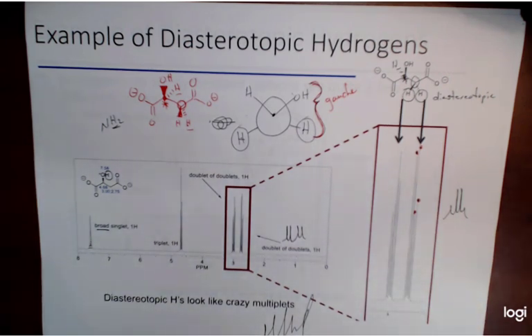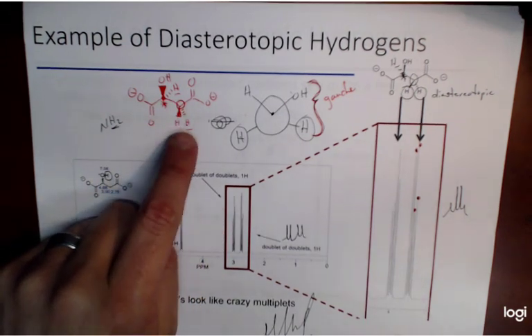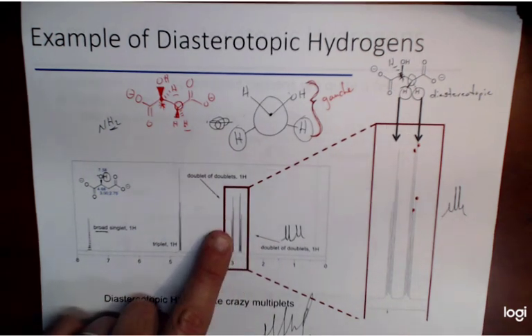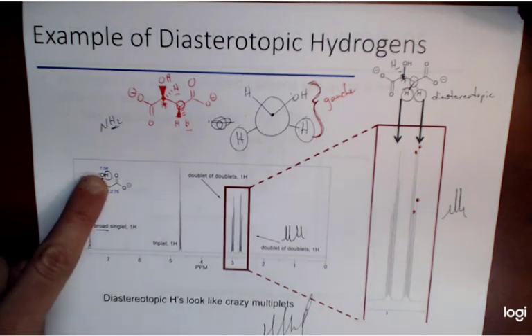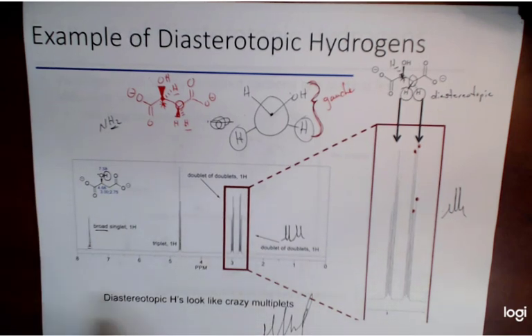All right, so the big thing here is, if we were to consider these two hydrogens to be equivalent, they only have one hydrogen neighbor, so they would give us just a doublet. But we don't see just a doublet anywhere. We see a doublet of doublets, a doublet of doublets, a triplet, and a broad singlet. And that broad singlet is the example of that OH that we saw when I talked about the previous worked example at the beginning of this video. I told you how we would see that as a broad singlet if it was an OH, and that's what we're looking at there.